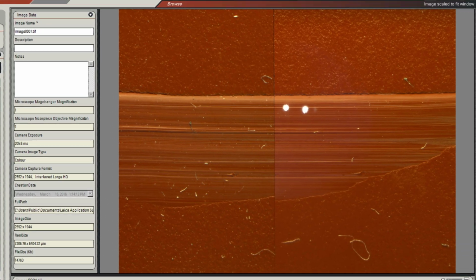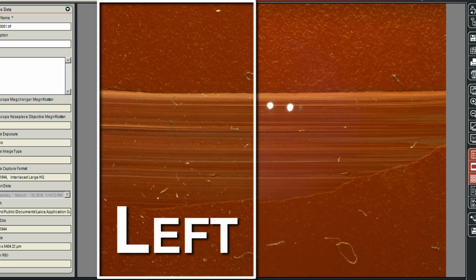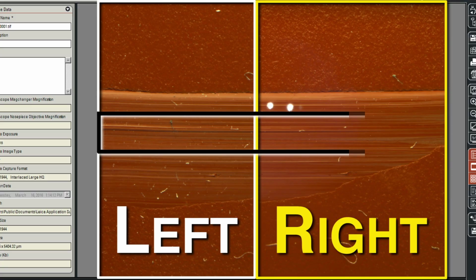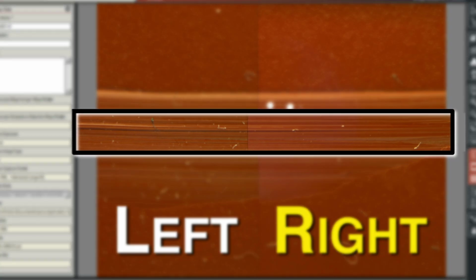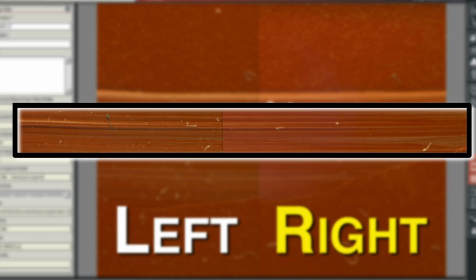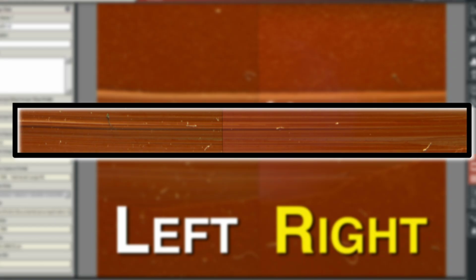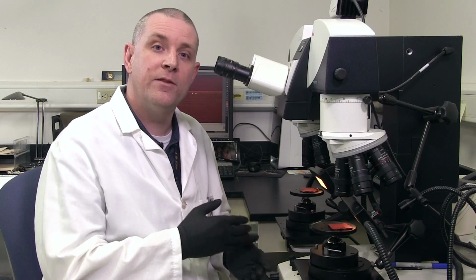And what I'm looking for is those lines on the left side of the microscope and the right side of the microscope to line up. And when they do, I can say that the two casts, the marks on those casts, were made by the same tool. And I can see that those marks all line up. So what that tells me is that the tool that we found in Hwantu Bai's truck made the marks that were found at the barn door.